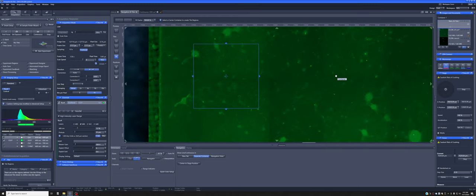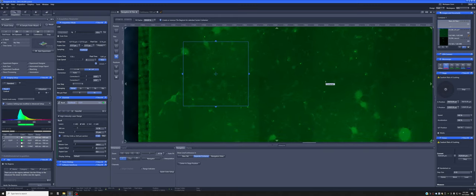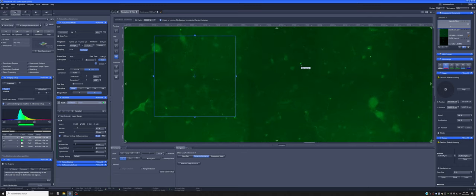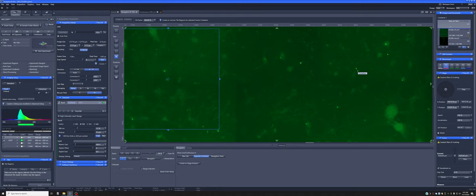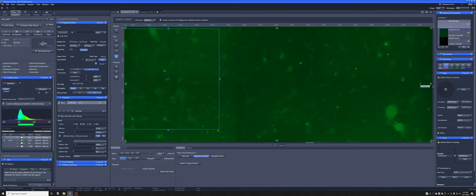So this is an example of neurons in culture and the transfected neurons are these bright dots. But if we are interested in the neurites that extend from those somas of those neurons, this resolution is really not enough for us to make decisions about where it would be best for us to image them, which neurons to image.